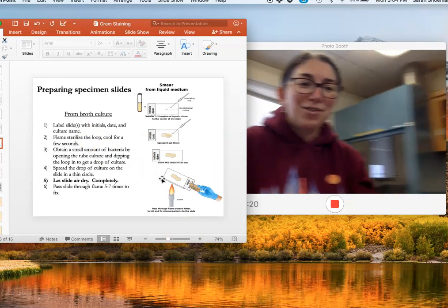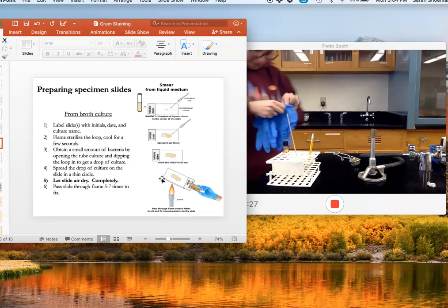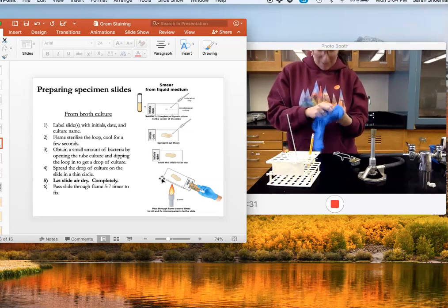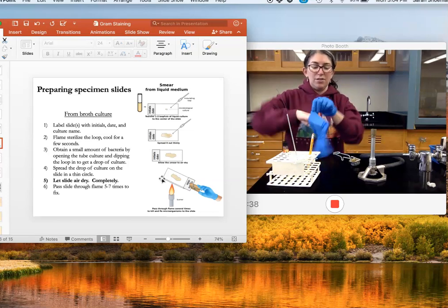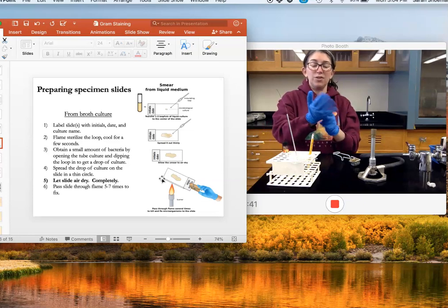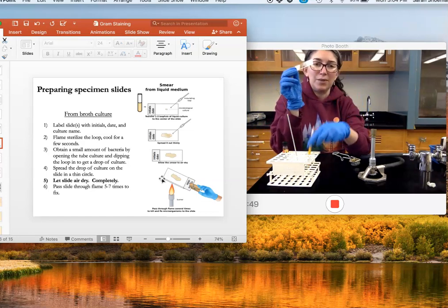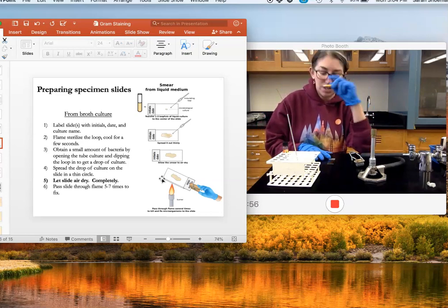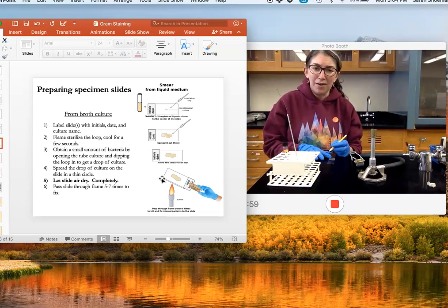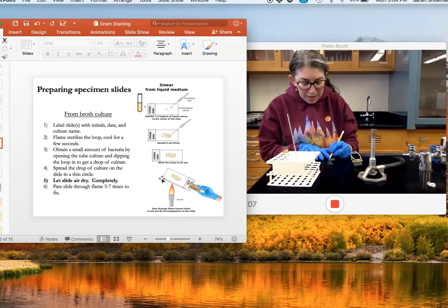So now we're going to actually do the procedure. We've got to prepare our slide — let me do my little lab setup here. I'm going to put on my gloves. The first thing we need to do is put the bacteria on a glass microscope slide. Before we prepare the slide we're going to label it — we always label our things so we know what they are. It's best to label the slide with a pencil, number two, because the decolorizer step is an alcohol that will wash off pen.